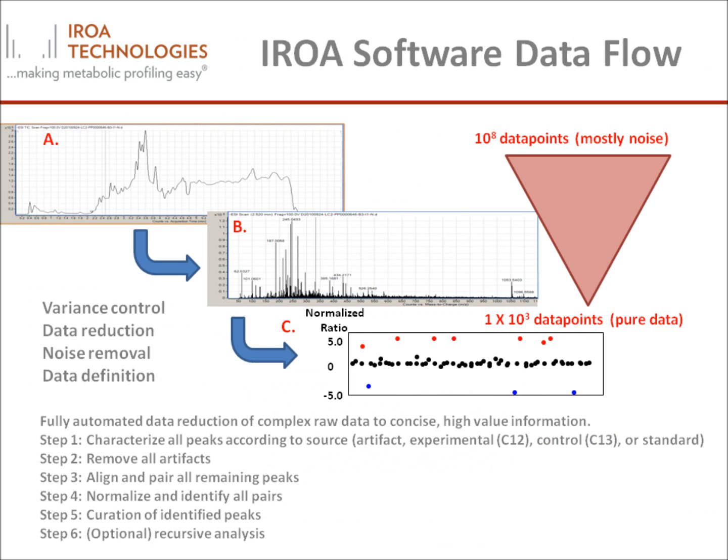The IROA ClusterFinder software finds IROA peaks based on the fact that all IROA peaks are mathematically calculable. When both C12 and C13 IROA peaks are present, each set of carbon isotopomers, C13 and C12, reliably and accurately counts for the other set, providing a redundant quality control check.